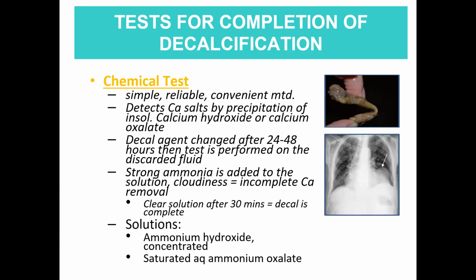It detects your calcium salts by precipitation of the insoluble calcium hydroxide or calcium oxalate. The decalcifying agent, after 24 to 48 hours, is changed and the discarded agent is tested. Ammonia is added, and if the solution is cloudy, calcium removal is incomplete. A clear solution after 30 minutes means decalcification is complete.